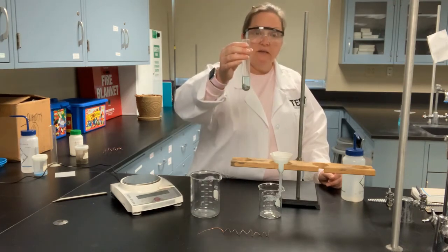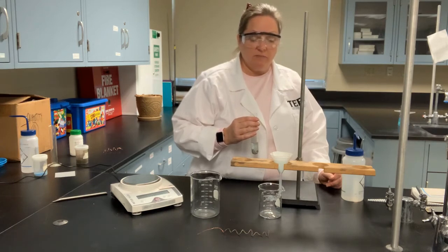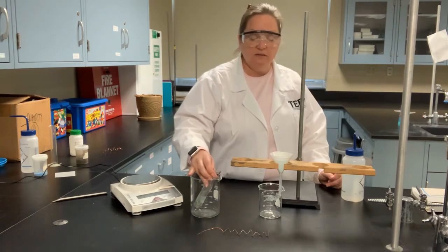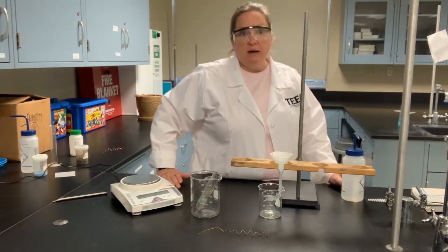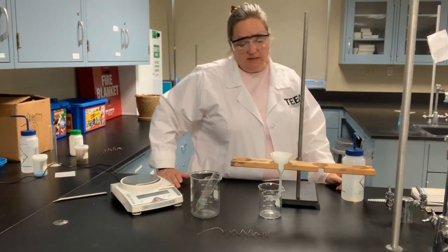Once I get this low enough and everything has run down in the filter paper, I can go ahead and add more. But this process takes about anywhere from 10 to 15 minutes in real time. So I'm going to go ahead and stop the video at this point, let the solution filter, and then continue on.